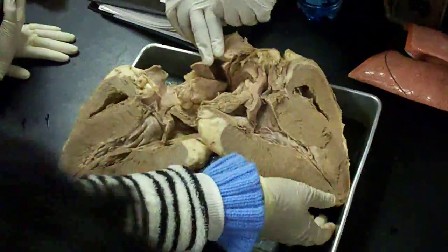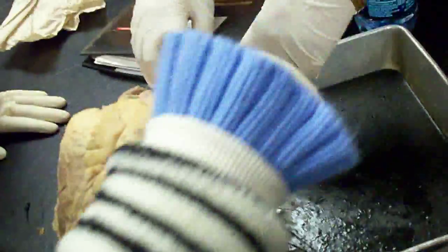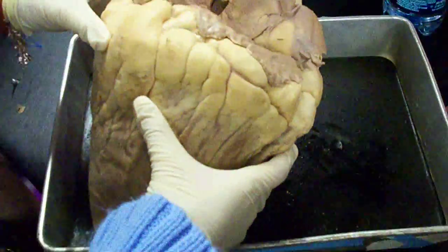For the pulmonary trunk — the pulmonary trunk is a hole that you can see from the front. Anything that you can put your finger through and it goes this way — that's the pulmonary trunk, even though they cut through it.